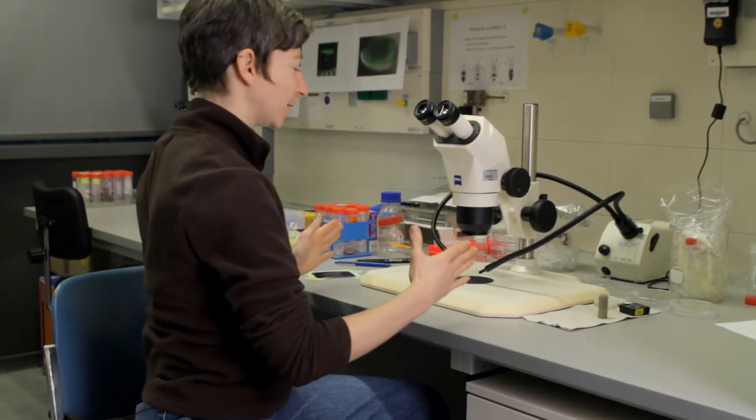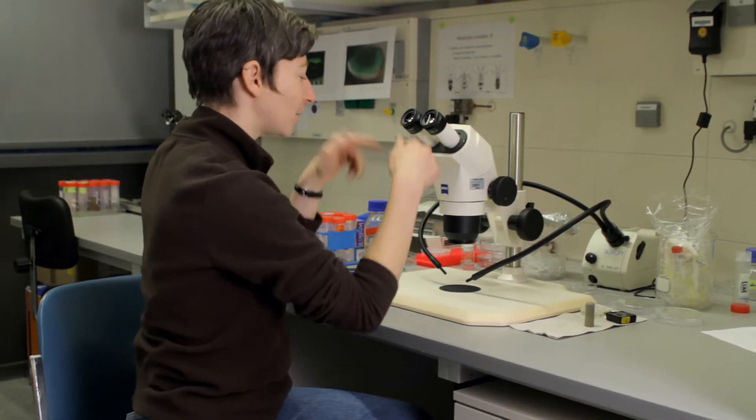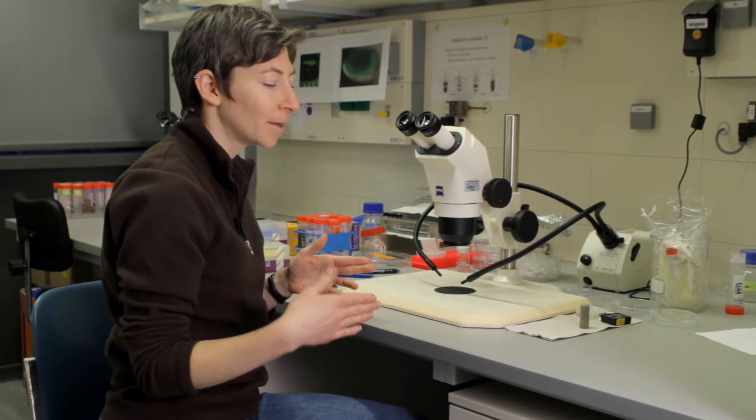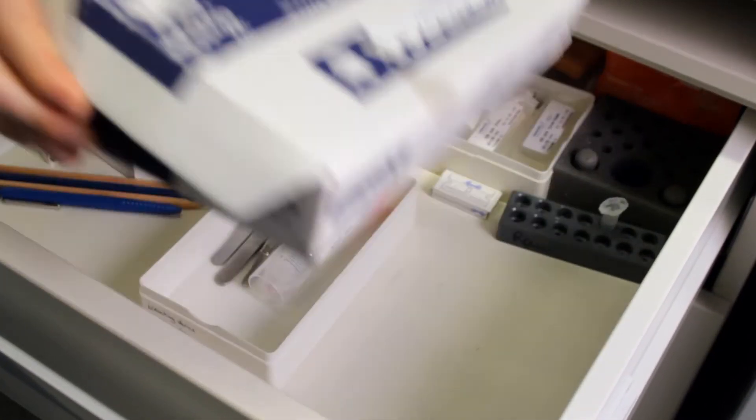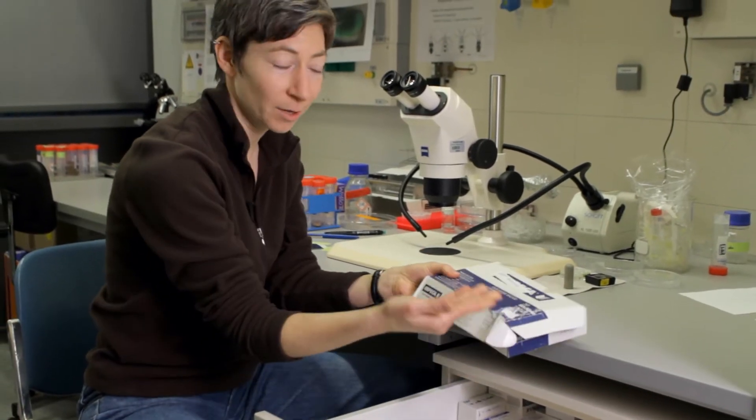So this is my normal working station and I would have my dissecting scope here, but then the tools I actually use are pretty much everyday things. So I keep them in such fine, well-preserved boxes.